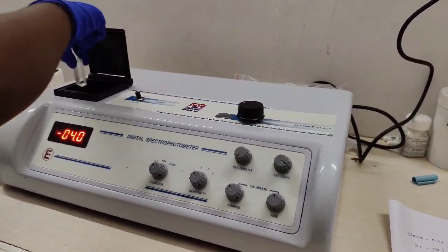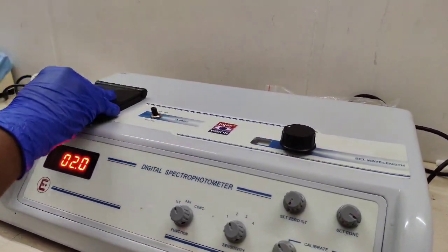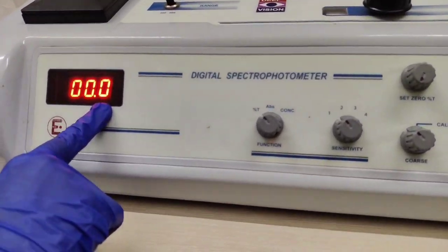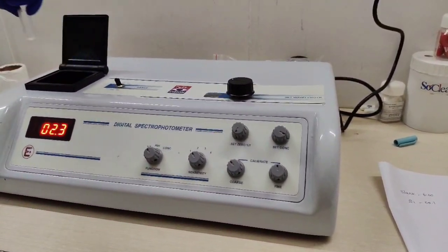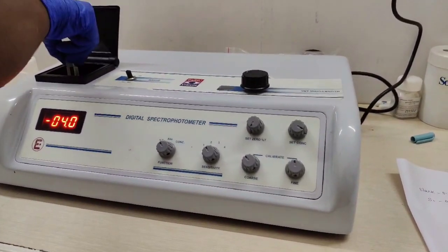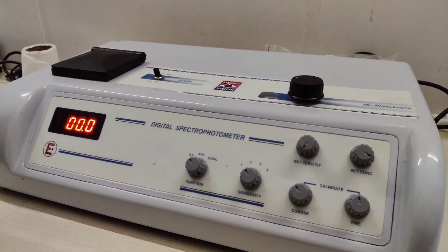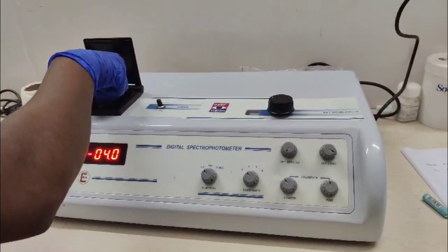Open the lid, put the cuvette in the spectrophotometer. Blank 0.00. Set the blank 00.